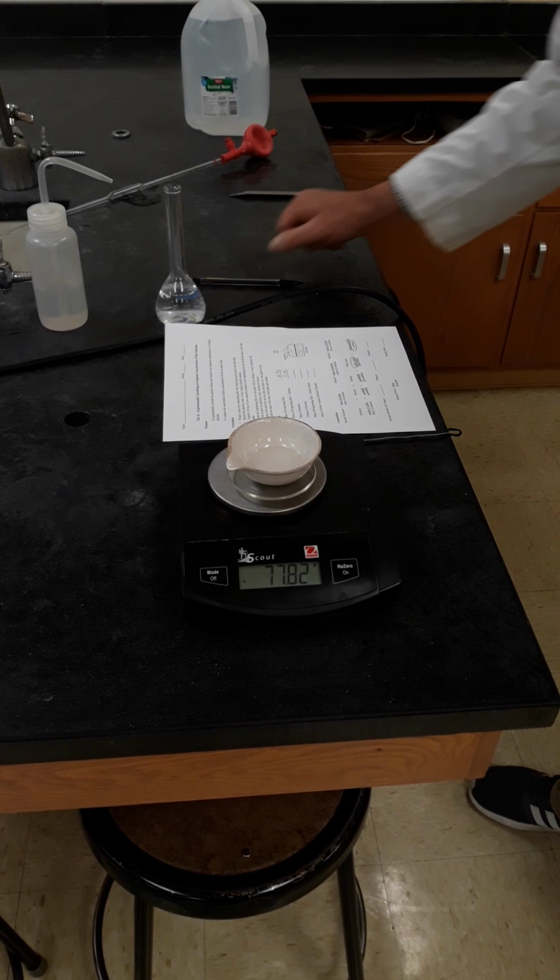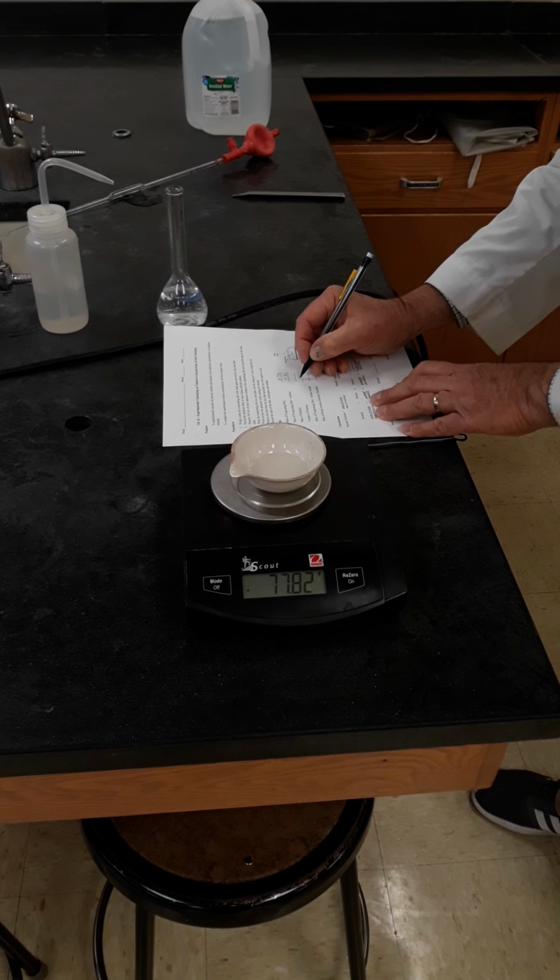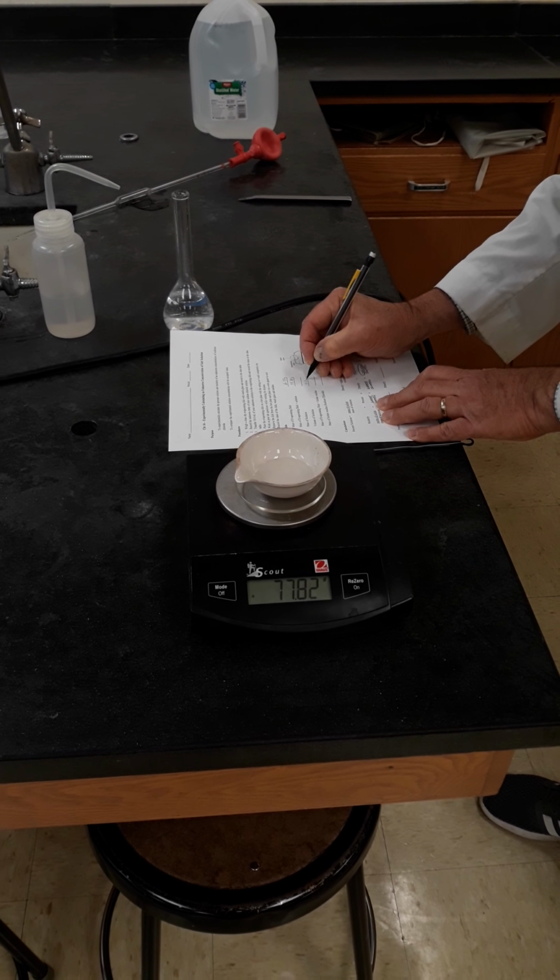So the mass of the solution we can get by subtraction. The volume of solution was 10.0 milliliters.